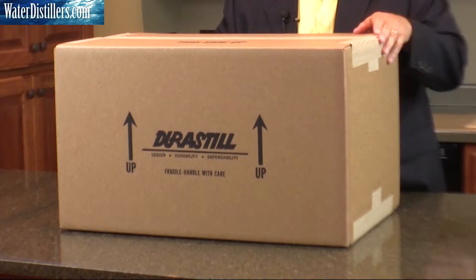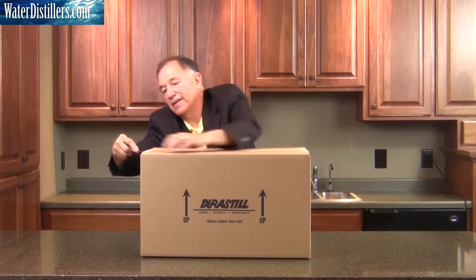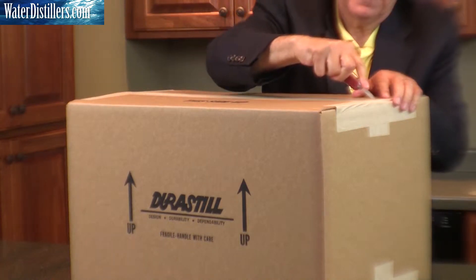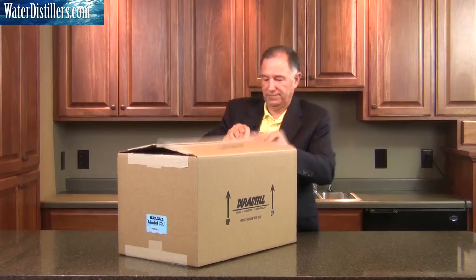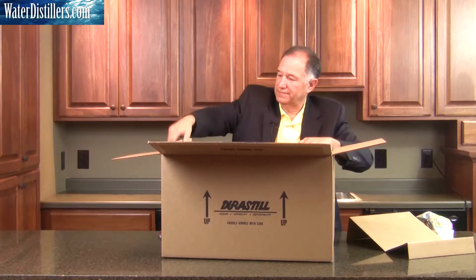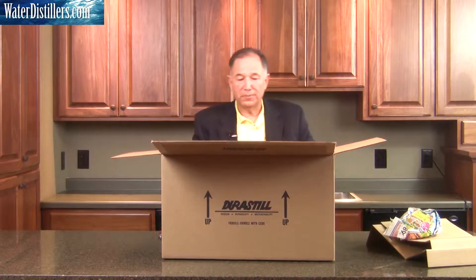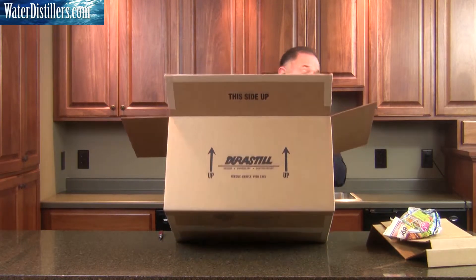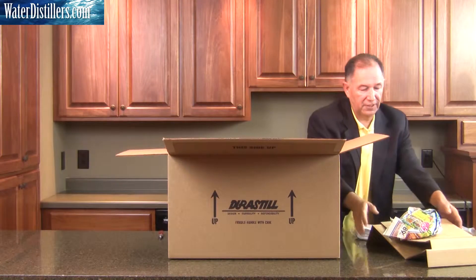Now we flip it back over on this side and open it up — as it says, this side up. We're going to open it on up. The distiller will be sitting inside and we just take out the stuffing and other items within the distiller and set them aside.